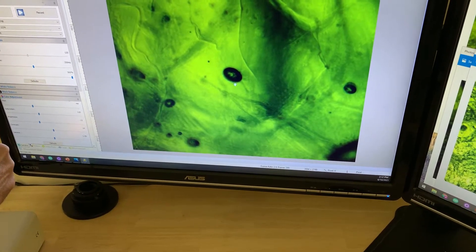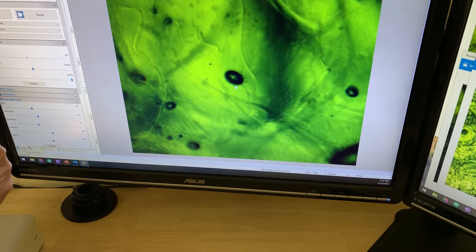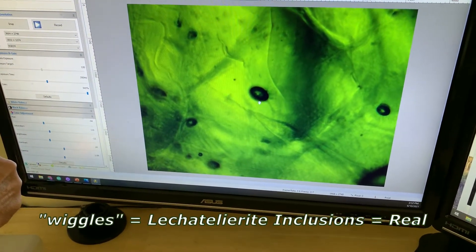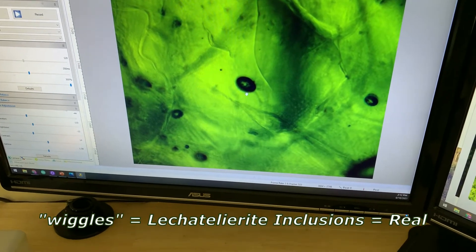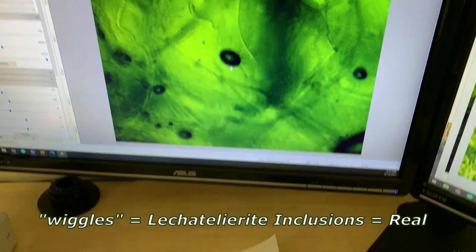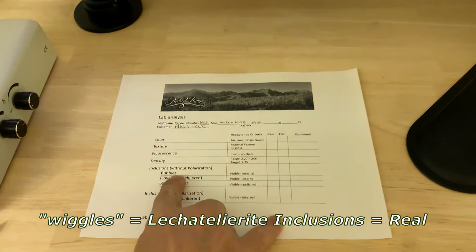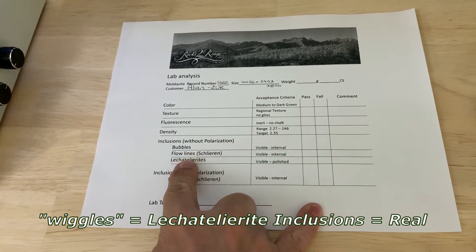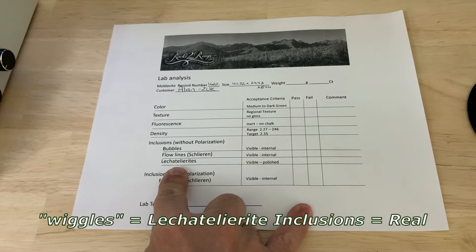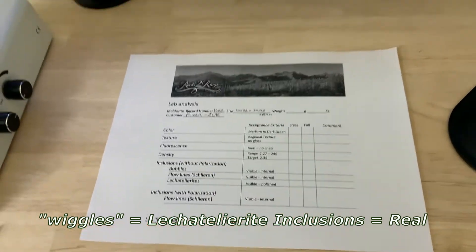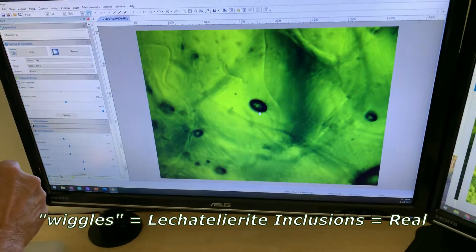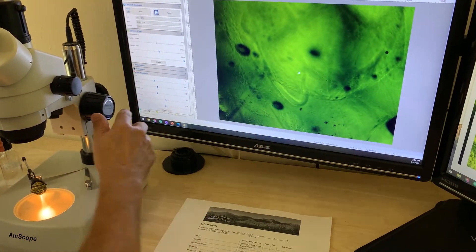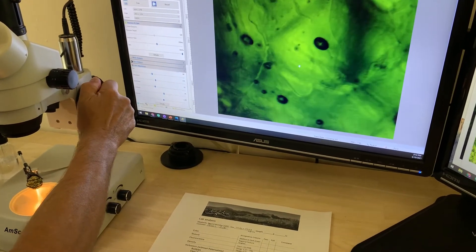You've got squigglies. Miss Sandra calls these wigglies—they're not really wigglies, they're inclusions. That's one of the things we're looking for when we look under the microscope without polarization: bubbles, flow lines, and what Miss Sandra calls the wigglies. It does have some wigglies in there. You can see these are deep into the moldavite, and you can actually focus on them.